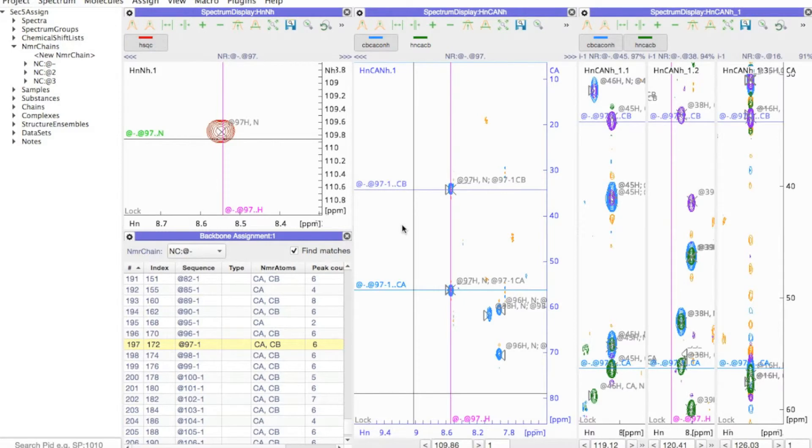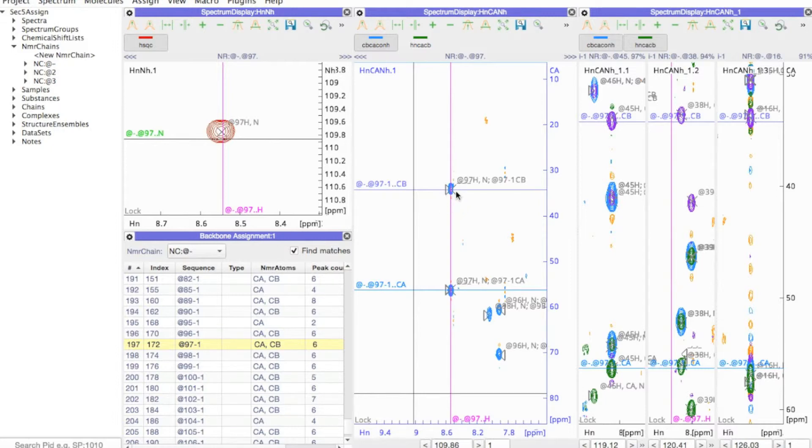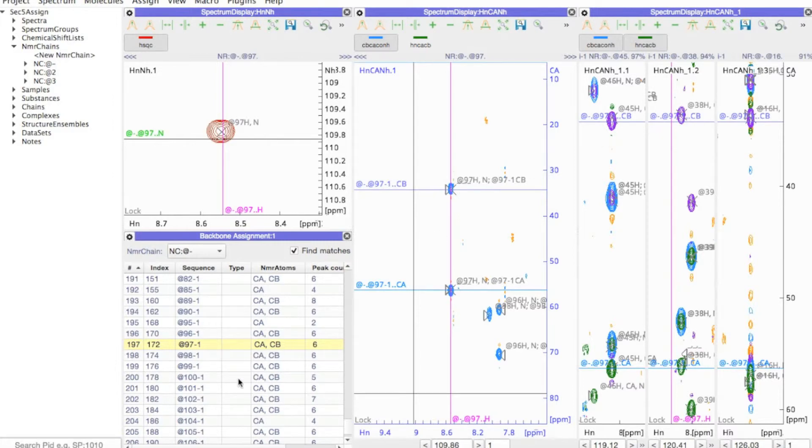With our new Backbone Assignment routine, this process has become easier than ever before. Here I'm going to start with peaks in my blue CB-CA-CONH spectrum and search on the right-hand side for matches in my purple and green HNCACB spectrum.